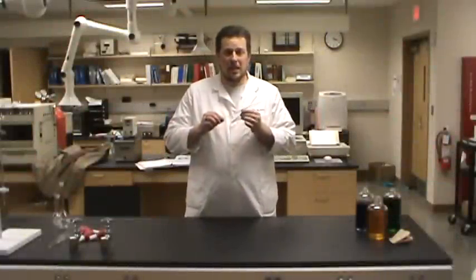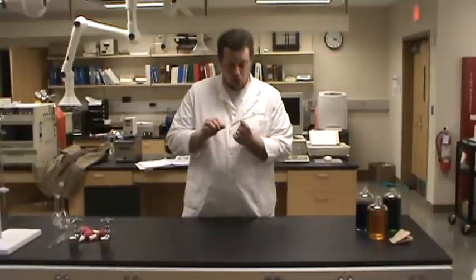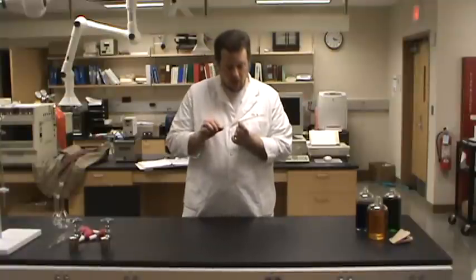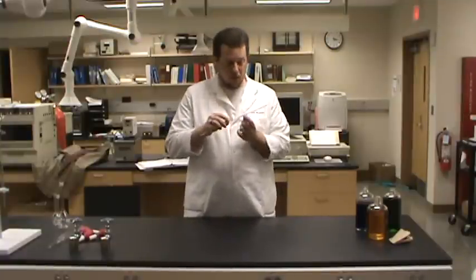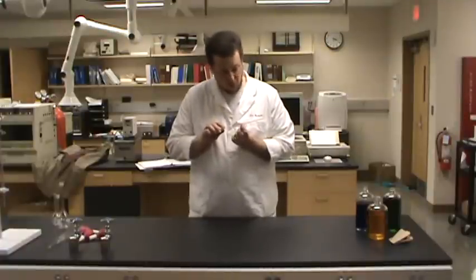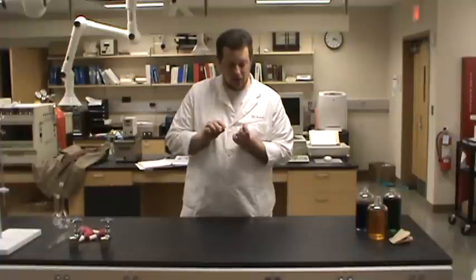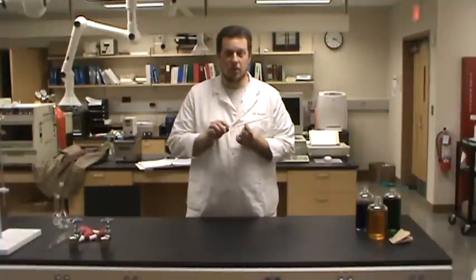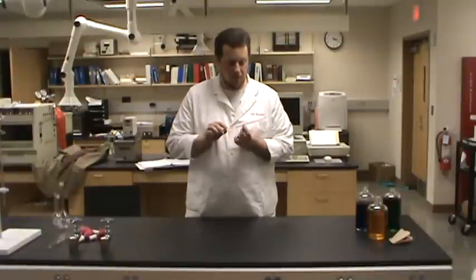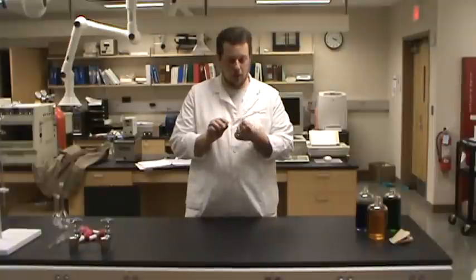It says TD 26 sec 20 degrees C. So what does that TD really mean? When we're using glassware that's calibrated TD, that means that this piece of glassware is calibrated to deliver, that's the TD, the calibrated amount of liquid, in this case, five milliliters. It should take about 26 seconds at 20 degrees Celsius to deliver five milliliters of liquid reagent. So again, watch your labels. Your labels will tell you most of what you need to know.